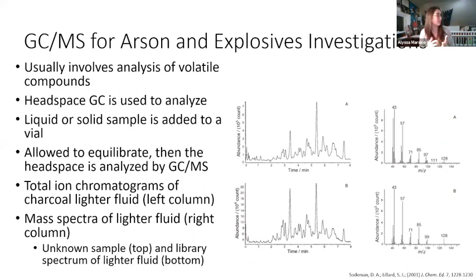Explosives, sometimes people get a little worried with explosives with GC mass spec because in order for things to be converted to the gas phase, you have to heat it. And heat and explosives really don't mix too well. As long as you know the point where you can heat an explosive sample up to before it goes boom, you'll be okay. One of my grad students right now is finishing up a project where he does explosives analysis on the GC mass spec. So as long as you're careful about it and you do your research beforehand, it's perfectly fine to do it.